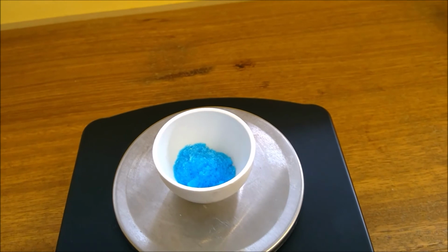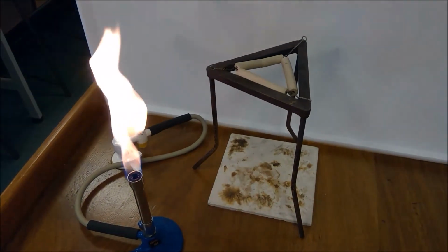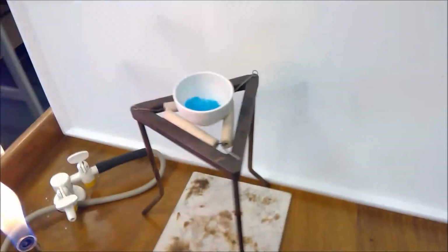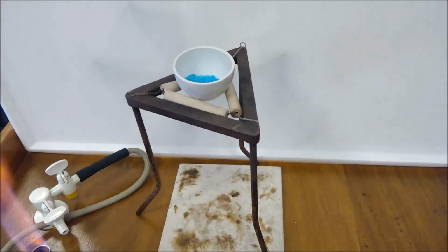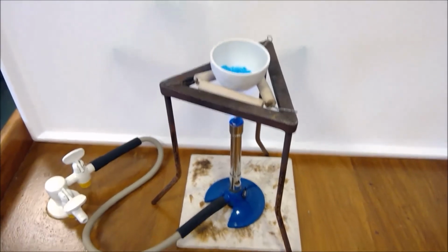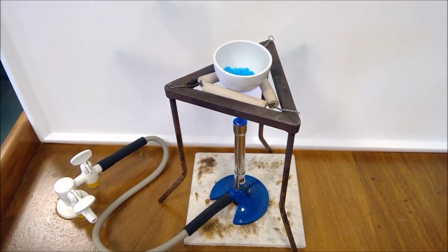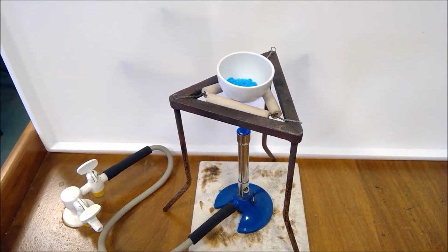And then we are going to take that and heat this over our Bunsen burner. So we have our tripod here, and in the middle of that there is a pipe clay triangle, and that's going to be used to support our crucible. So I'll pop that into the middle there, and then we're going to put our Bunsen burner underneath. So I've turned that to a roaring flame, and then we're going to heat that strongly for 5 minutes. So you might like to think about what you expect to observe and what you expect to happen to the mass. And then after the 5 minutes, we'll go and reweigh our sample.